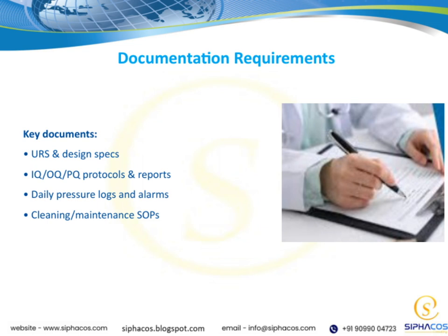Next, there are the IQ, OQ, and PQ protocols and reports. These are critical validation documents that confirm the equipment and processes meet the specified requirements at different stages. We also need to keep daily pressure logs and alarms, which are vital for monitoring system performance and catching issues early.